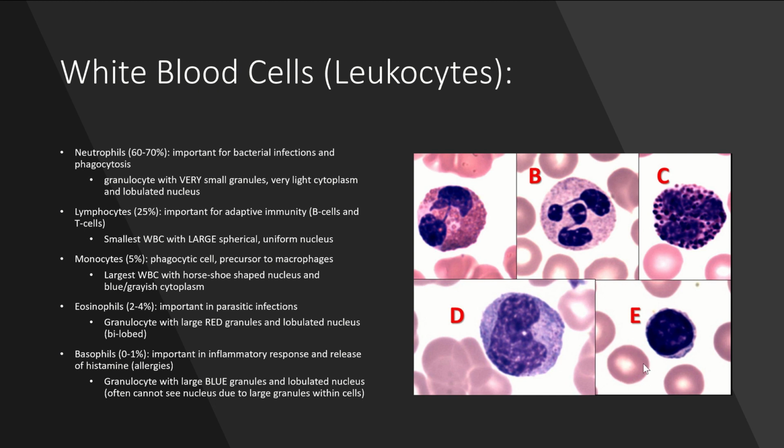Right? They're only a little bit larger than the red blood cells around them, and they have a very large spherical nucleus. You can see here, this whole lymphocyte is pretty much all that dark blue, and it is all that color because that is all the nucleus of this lymphocyte. So this lymphocyte is almost entirely nucleus. You can see a little bit right here of just the cytoplasm. So there's just a little bit of cytoplasm around the nucleus, but it is almost entirely nucleus, and that is how I know that it's a lymphocyte.